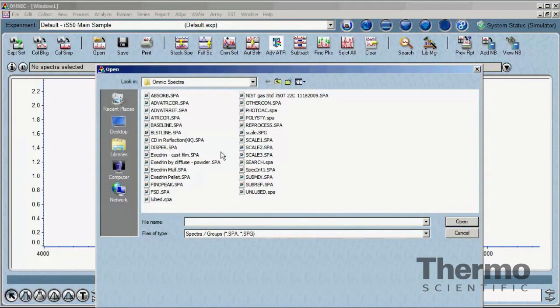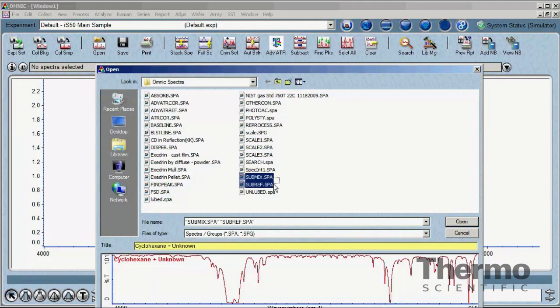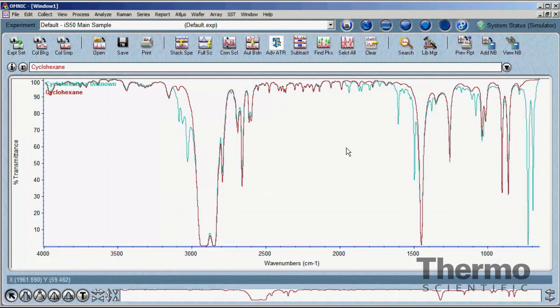Omnic software installs a number of spectral files on your hard drive. These can be used to practice the available tools found on the menus. For this tutorial, we will use the files submix.spa and subref.spa to demonstrate the recommended use of the subtraction tool.